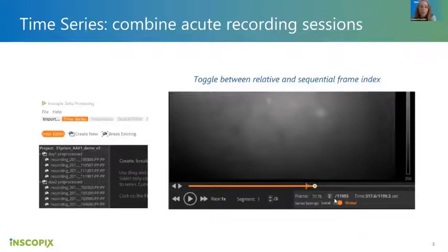I don't know if we need to bring it up in every single demo because most people aren't using that option, but it might be good to mention at some point that if you are going to export your files as TIFFs, you may not be able to align the time series appropriately in the GUI. You could just point it out, but I don't think we should spend a lot of time on it for every customer because most people won't do that and they might just get confused.